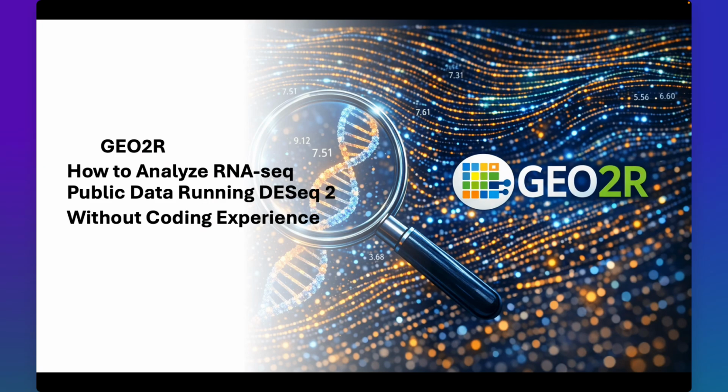Ever wonder how to analyze mountains of RNA-seq gene expression data to find meaningful insights without having coding experience? Today we're diving into GEO2R, a powerful web-based tool that makes these complex tasks accessible to everyone.